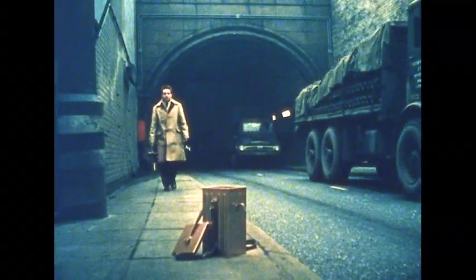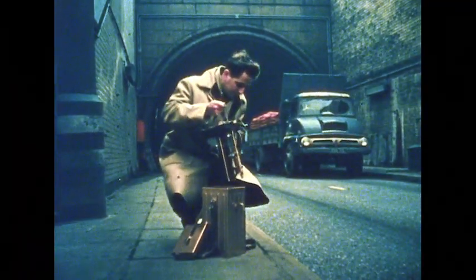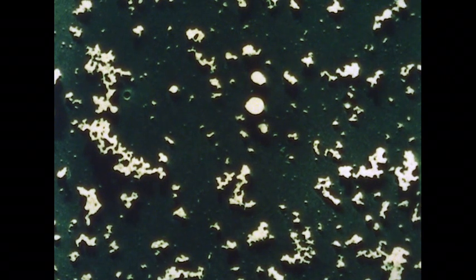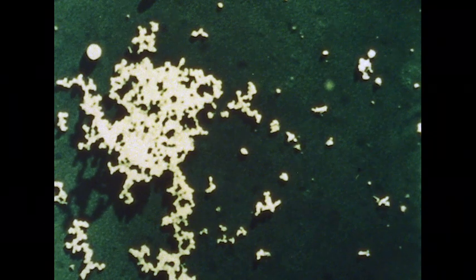The scientist studying air pollution takes samples of air from tunnels and city streets. With the electron microscope, he can distinguish the impurities which we inhale: short chains of carbon expelled from the exhausts of vehicles, and large carbon particles from domestic chimneys.